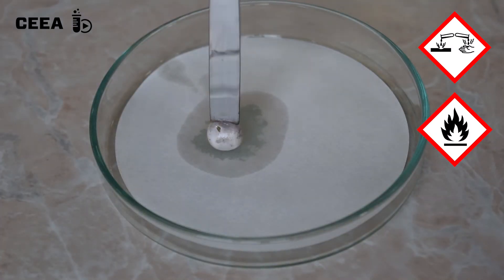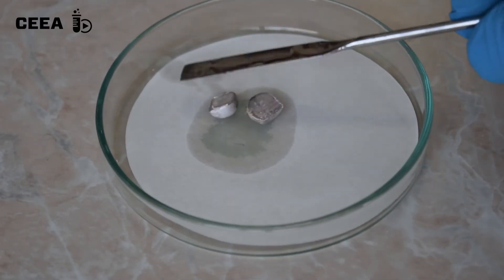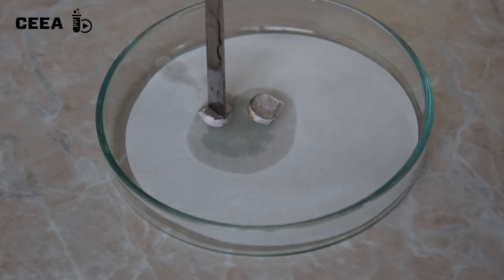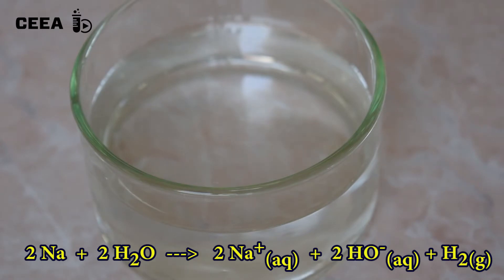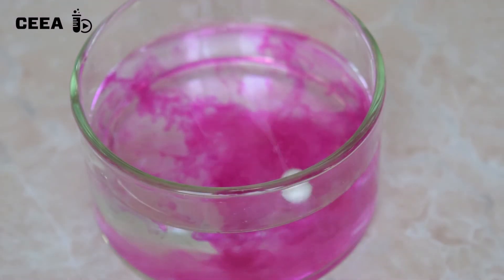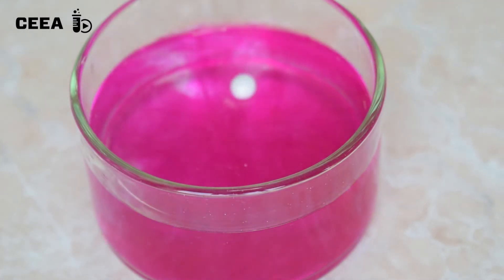Sodium is kept under paraffin oil. Dab the piece of metal first before reacting it with water. Take a 0.1 g piece of sodium and place it in a crystallizer half filled with water and some phenolphthalein.